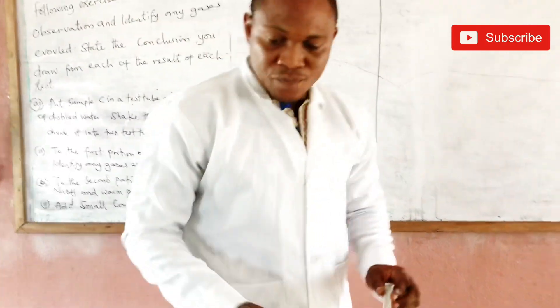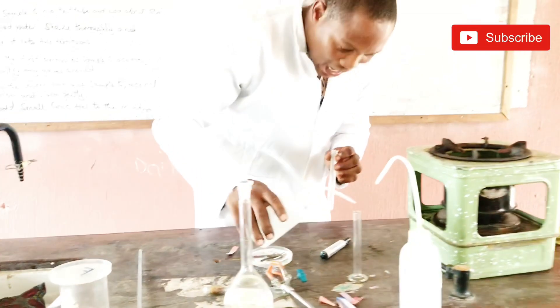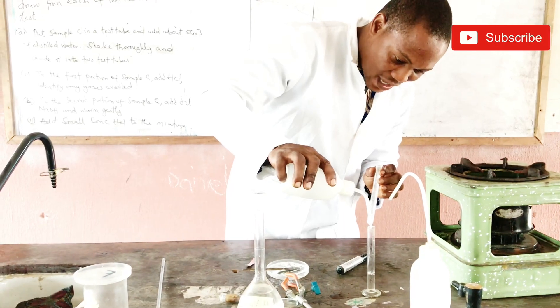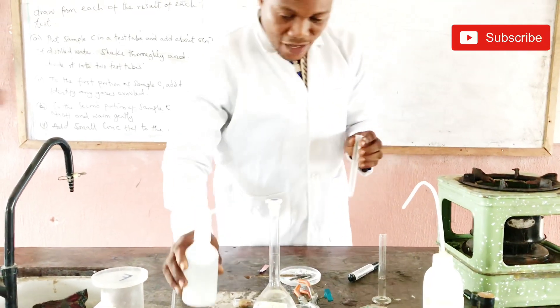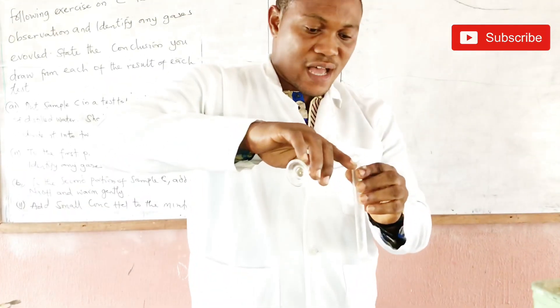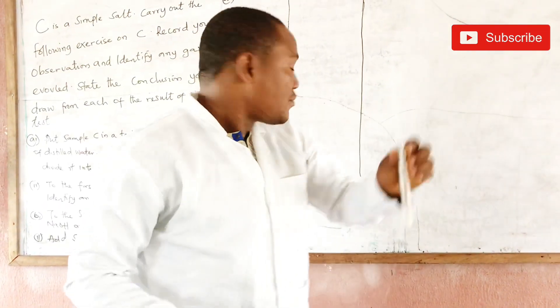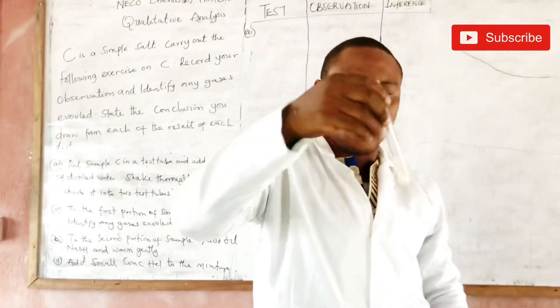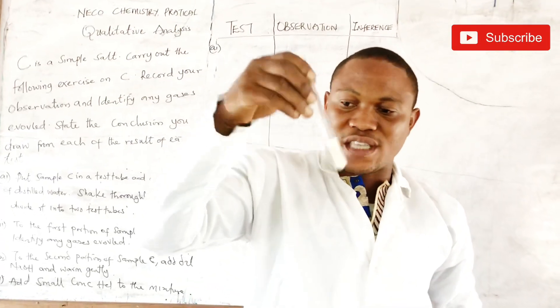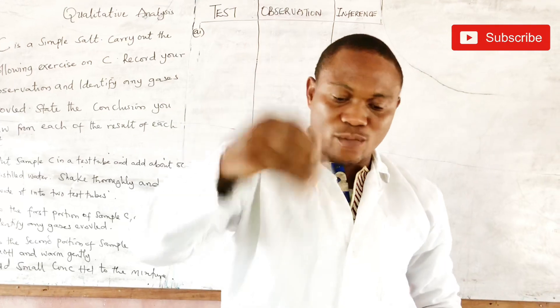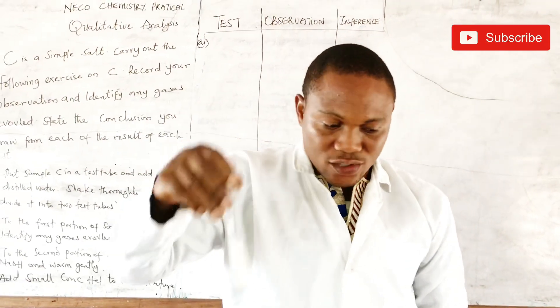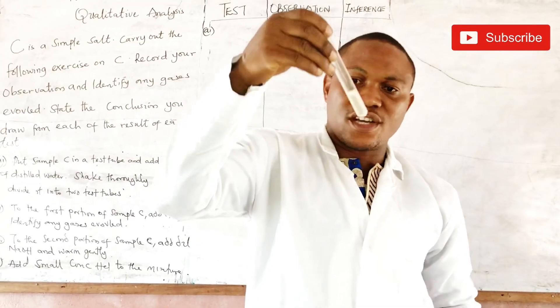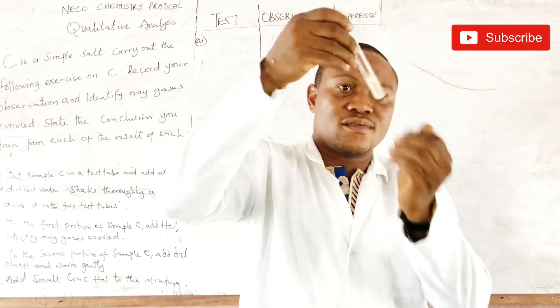I add about five centimetres cubed of distilled water — measuring approximately five centimetres cubed. Then the instruction says to shake thoroughly. For every test you carry out, you must definitely observe something.